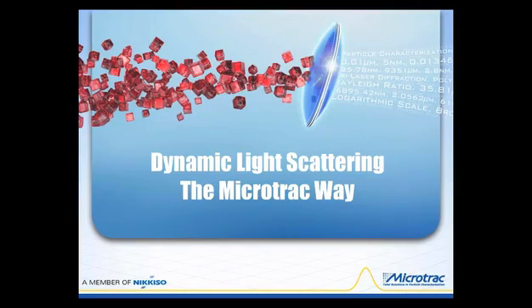What I'm going to try to do today is go through the basics of dynamic light scattering and along the way indicate where the Microtrac way is implemented.